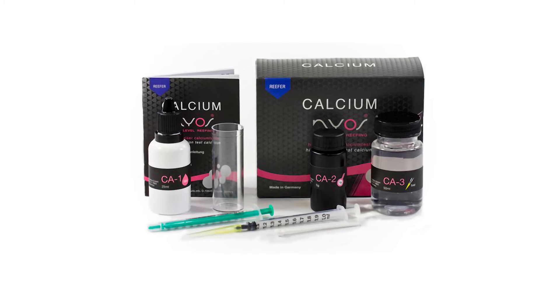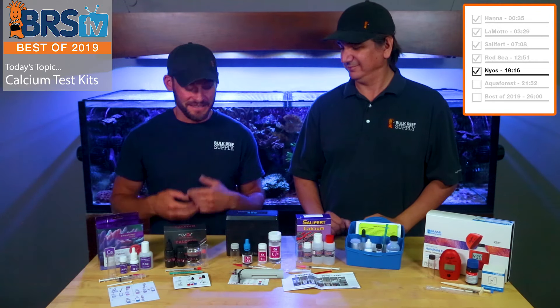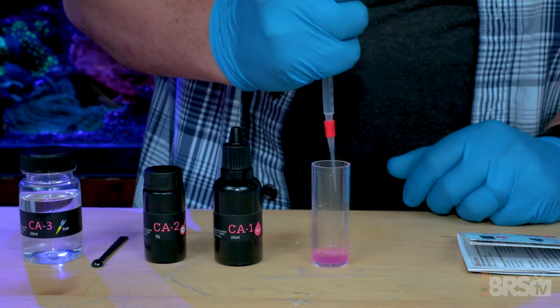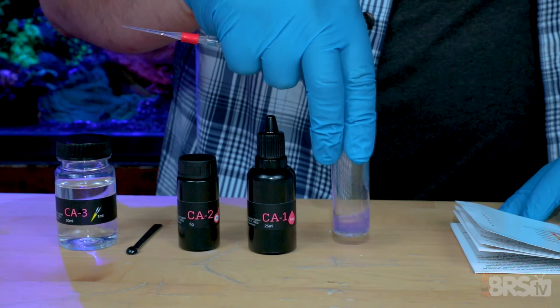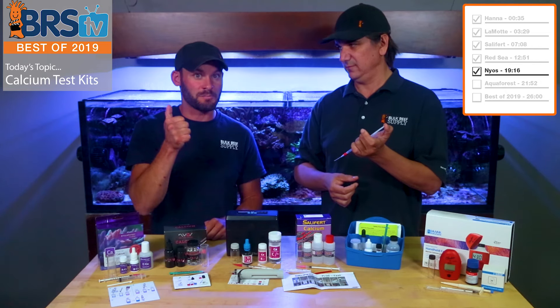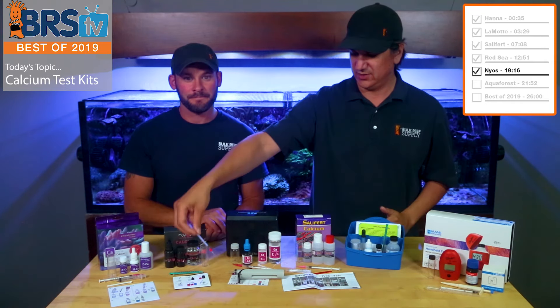The calcium test kit from Nyos is next. Right off the bat this thing looks nice — the black bottles, black packaging, the dual syringe. I like the titration syringe on this one in particular. Something about the really fine long tip feels like I can get more accuracy. It has really good tension where I'm not doing spurts and squirts into the jar — it's really easy to get single little droplets out of it because there's a proper amount of tension.